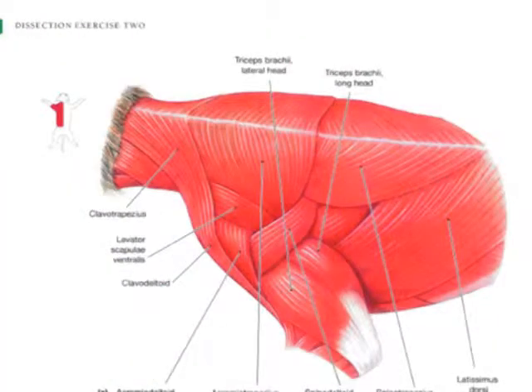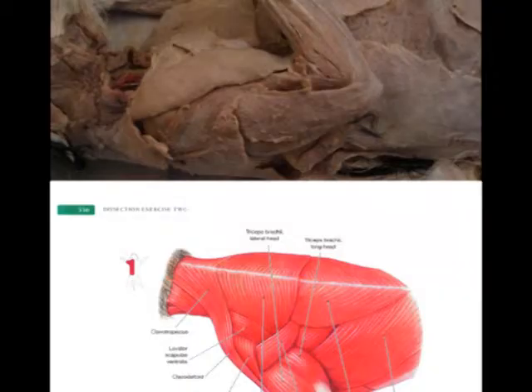The back consists of trapezius muscles and deltoid muscles. The 3 trapezius muscles are closer to the spine, while the 3 deltoids are farther. From top to bottom, they are clavo, acromyo, and spinal. So the back muscles are the clavotrapezius, acromyotrapezius, spinotrapezius, clavodeltoid, acromyodeltoid, and the spinodeltoid.